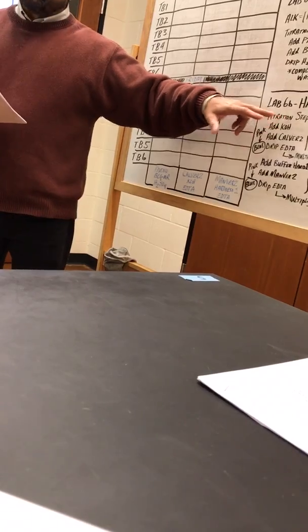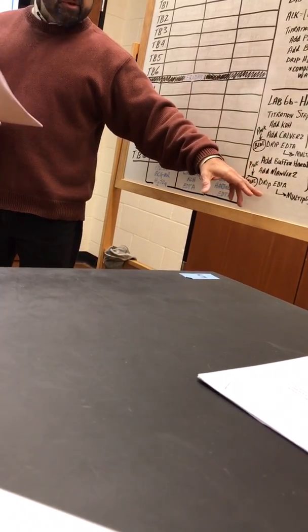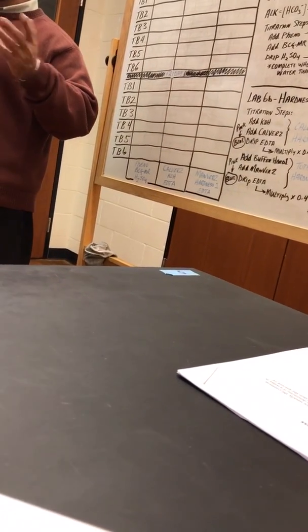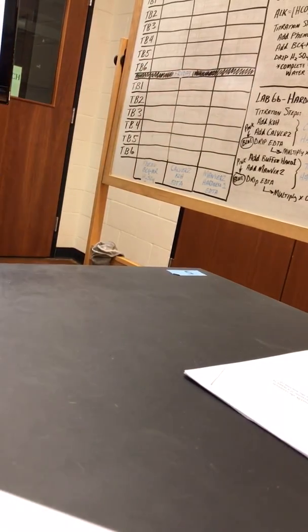Okay, so the first thing we're going to do is the calcium, so we're going to measure the calcium carbonate. The second calculation or determination we're going to make is the total hardness. So the difference between those 2 numbers would be what? Your magnesium hardness. All right? You have total minus the calcium, you have your magnesium left. Okay? So keep that in mind as we're running through this.